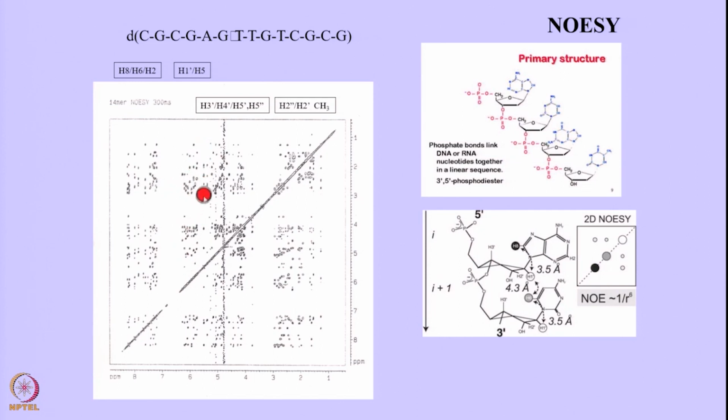1 prime 2 prime peaks will also be seen in the COSY spectrum. Therefore, once you have the 1 prime identified, you will have the 2 prime, 2 double primes identified there. You will also see the 2 prime, 2 double prime cross peaks here, and these are clearly, distinctly seen at a different place. And then from the 1 prime you will have the 3 prime, 4 prime peaks which are present here in this area. So, the whole spectrum can be analyzed once you get these 1 prime assignments here, and you also have these base to base assignments here in this area.